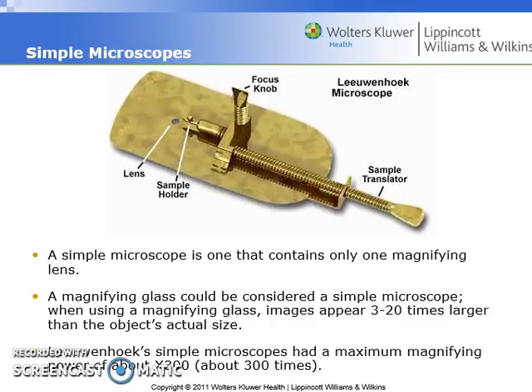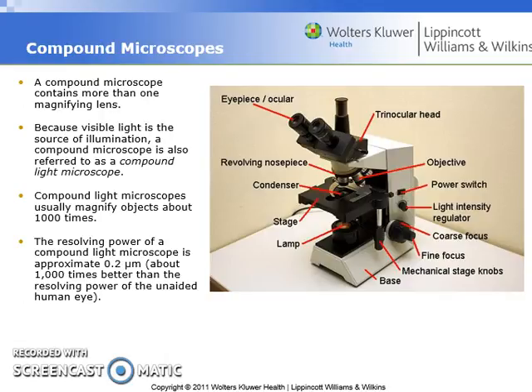In the classroom and in the laboratory, when researchers and students as well as instructors are looking at bacterial organisms or other microorganisms underneath the microscope, they typically are relying on a tool known as a compound microscope. And a compound microscope contains more than one magnifying lens. So you've probably seen many of these in some of your previous courses at the college. But these particular microscopes are fitted with a series of different lenses.